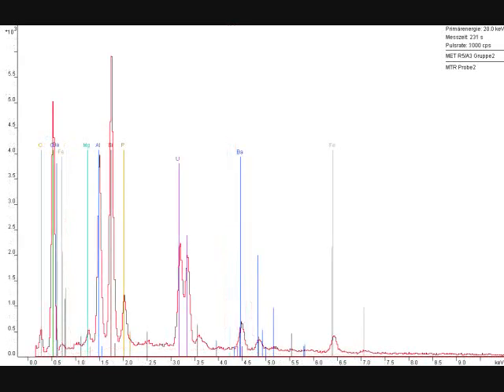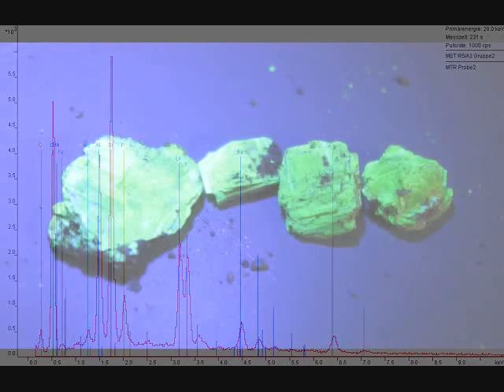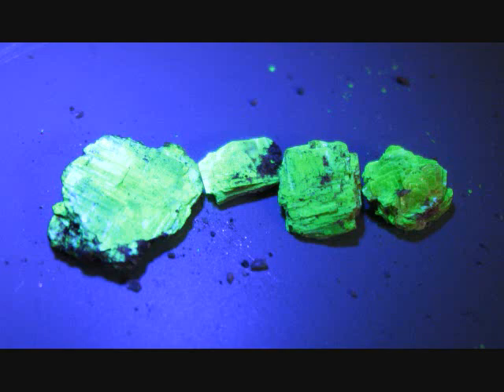I also had some of my nice green fluorescent uranium minerals analyzed. And what you can see here in the middle to the right is a peak of barium. So while it was sort of unclear whether I had autunite or uranocircite before, this clearly tells us that I actually found uranocircite. As a reminder, here is a photo of the minerals I found under UV light, so you can see the fluorescence.